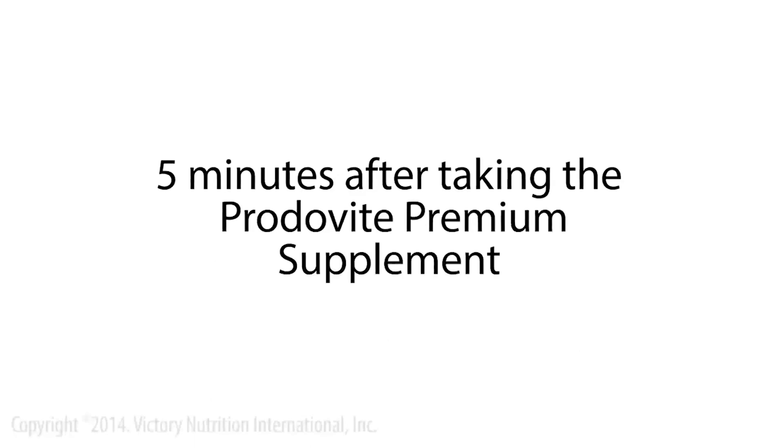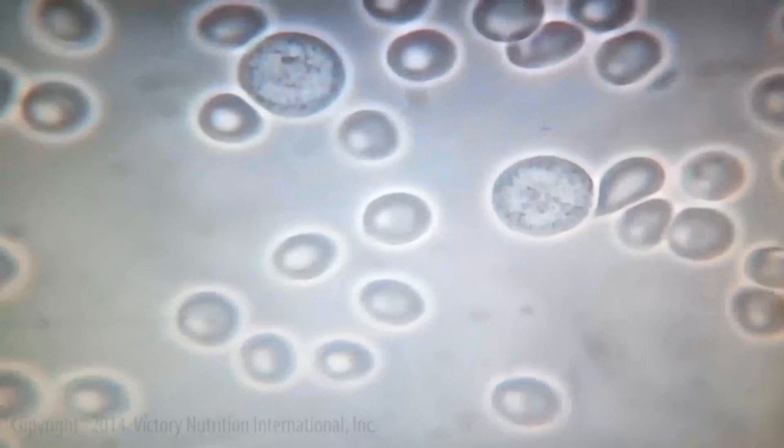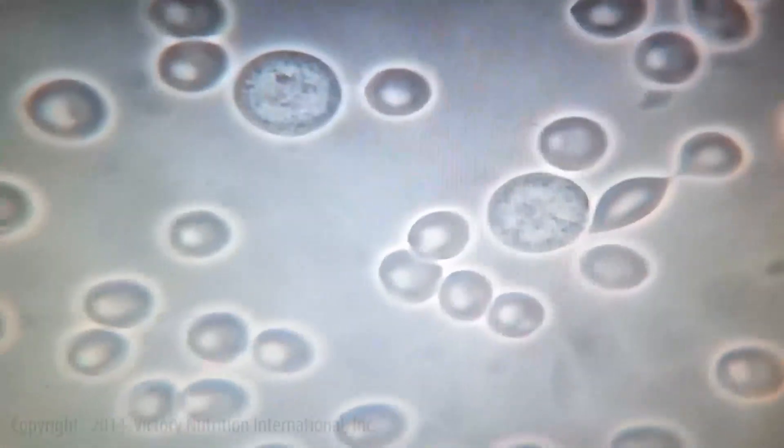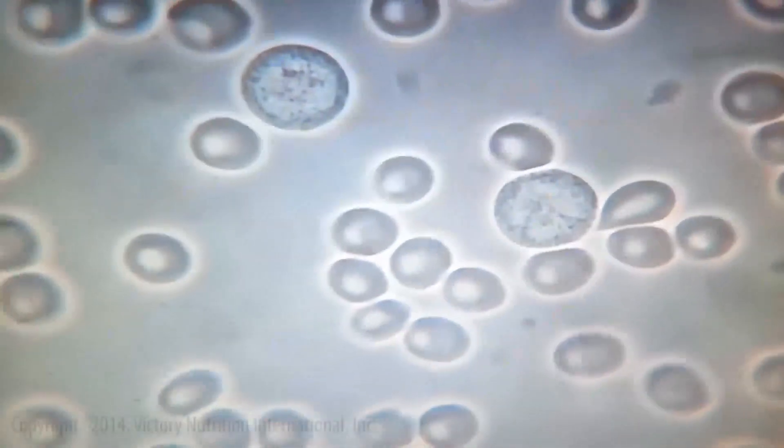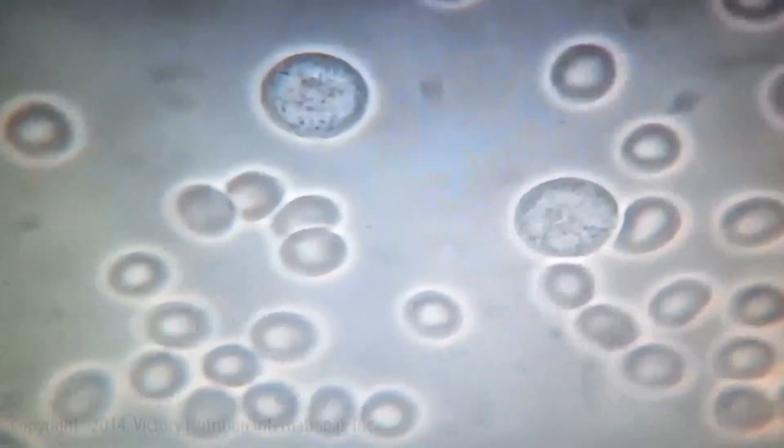This is five minutes after taking the multi, and we've restored the negative charge. The red blood cells are very loose and free-flowing. There are two neutrophils — one in the top left corner and one in the bottom right corner — and you can see that the neutrophils are four times bigger. It's been just five minutes.